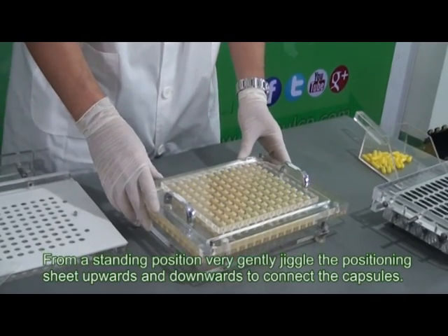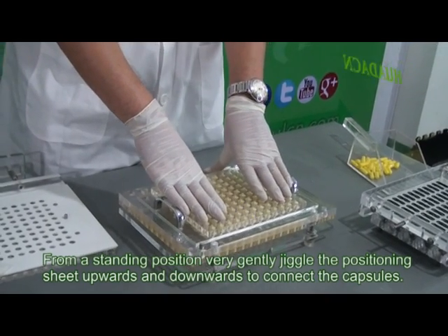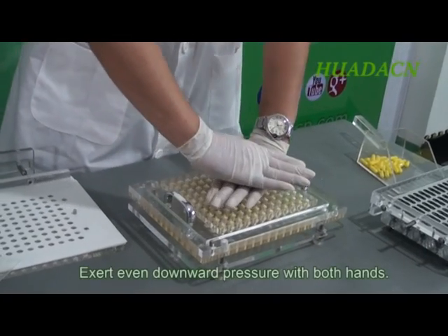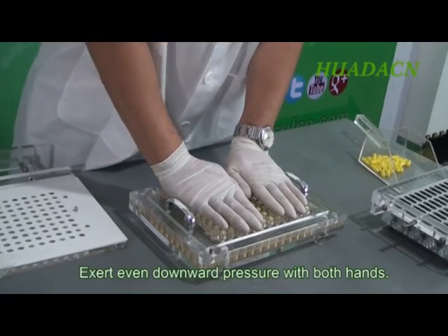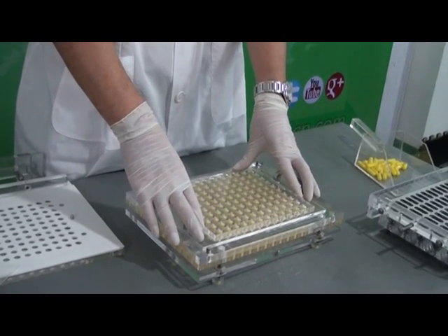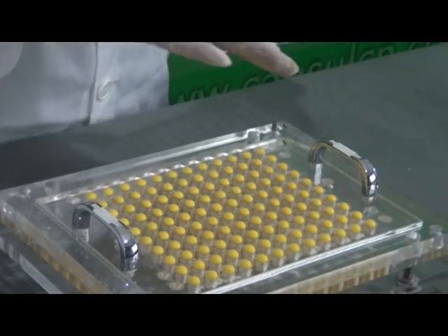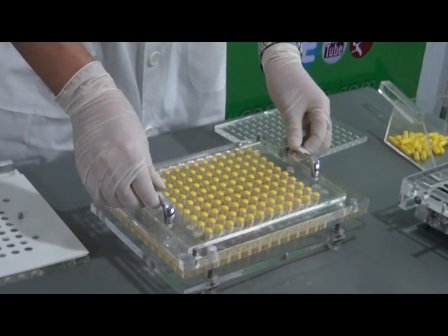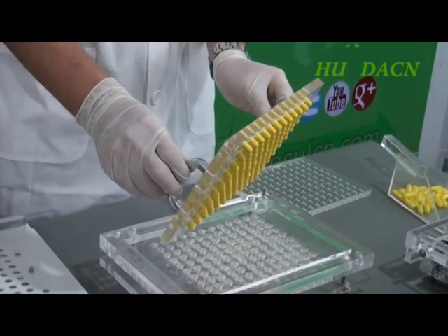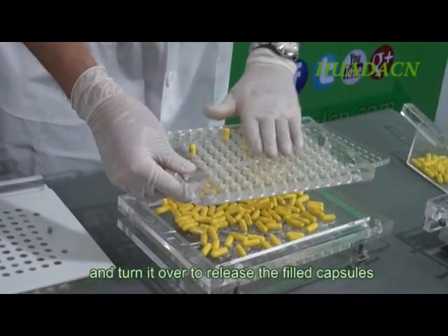From a standing position, very gently jiggle the positioning sheet upwards and downwards to connect the capsules. Exert even pressure downwards with both hands. Remove the cover plate. Remove the positioning plate and turn it over to release the filled capsules.